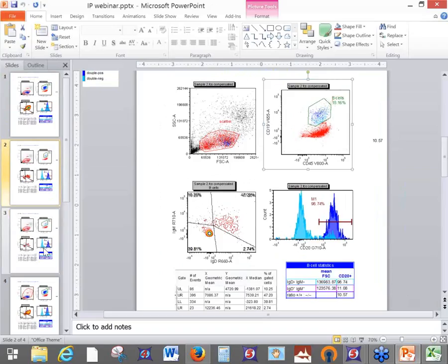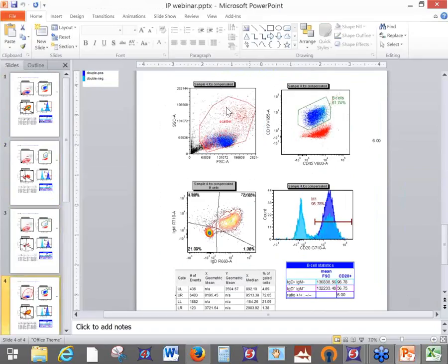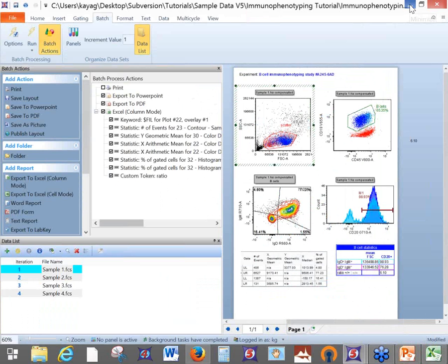We made that marker a little bit smaller. Go to the third iteration, everything went back to baseline. And then the number 4, I made that scatter gate very large. Okay, so that should be pretty useful for you if you need to adjust gates between samples. It allows you to do it very quickly, make the decisions as you go.